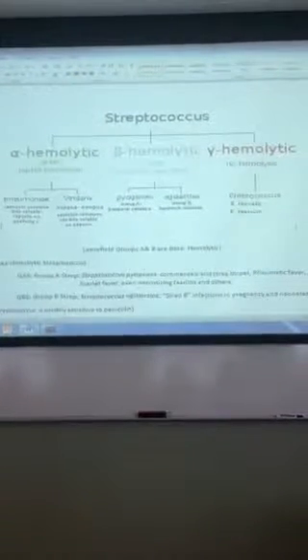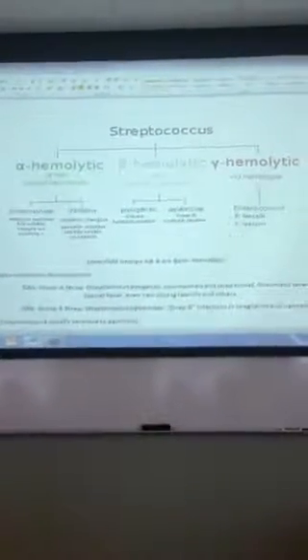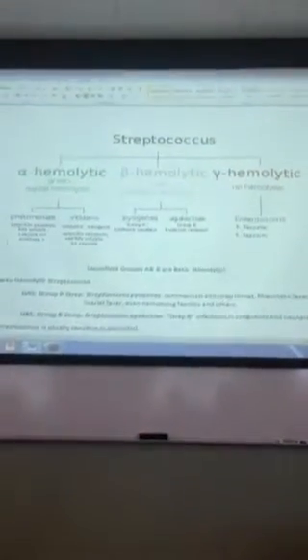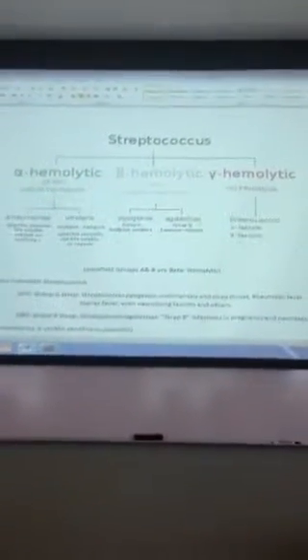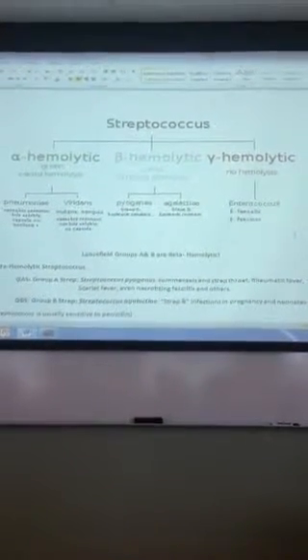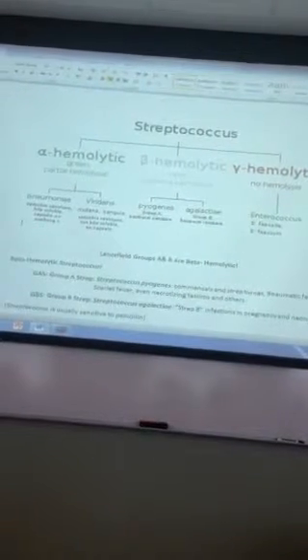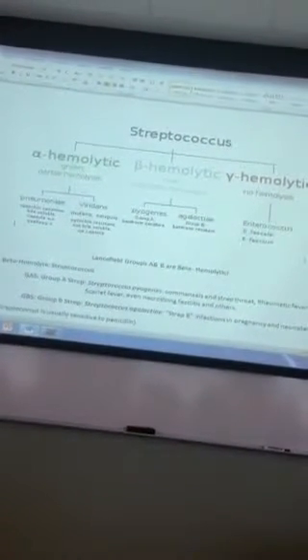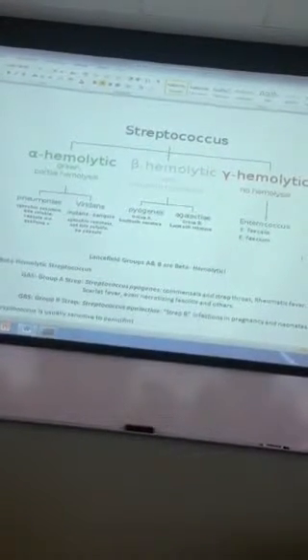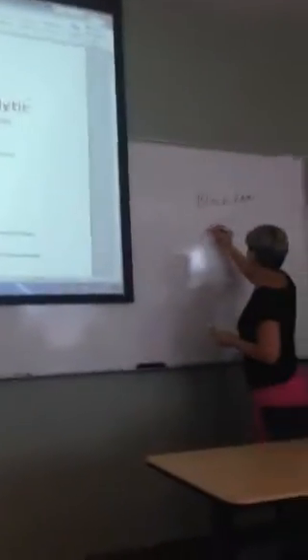They consider blood agar a type of special media. In fact, they consider it a type of differential media. Blood agar is a Petri plate and it's red. It looks like blood. Do you know what chocolate agar is? Looks like chocolate pudding, but it ain't chocolate pudding, it's dried blood.